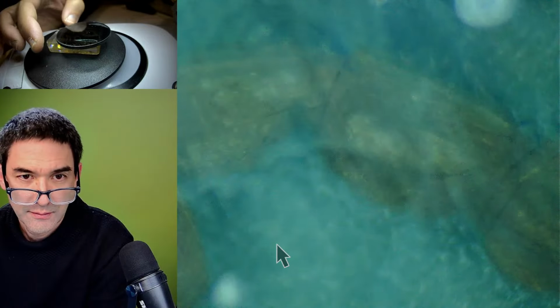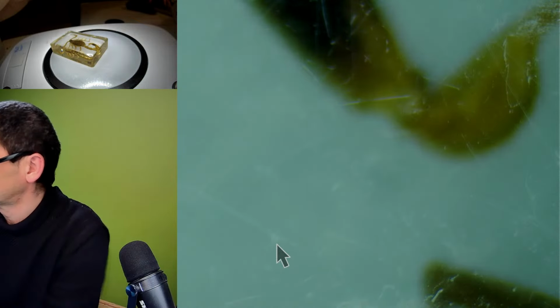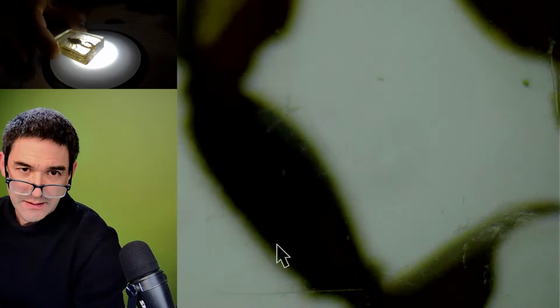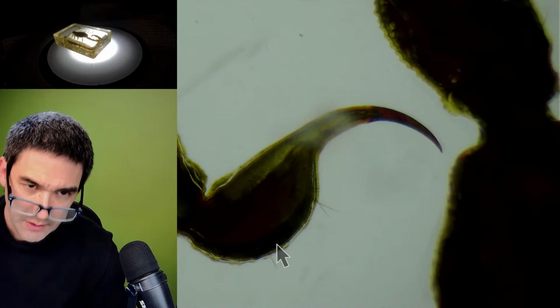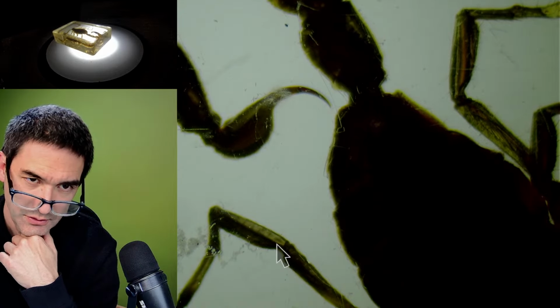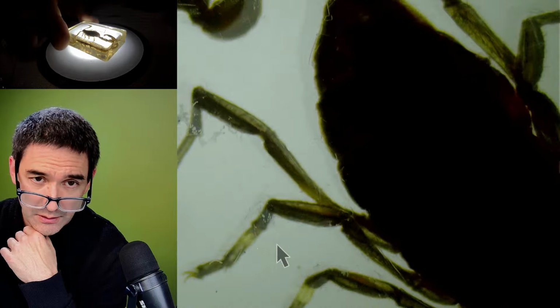Now the polarizing filter actually causes more dust and dirt. Let's do the following. What happens if I put light from the bottom? This is still from the top. So this is now light from the bottom. See, that's the stinger. Pretty scary looking as well. But because the scorpion, not the insect, scorpion is not an insect, because the scorpion is so dark, you don't see a lot.